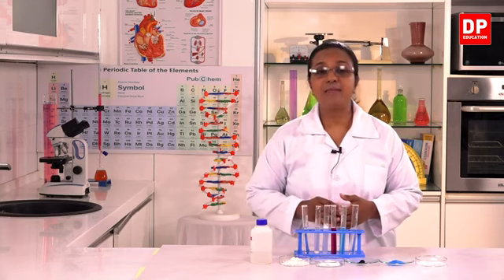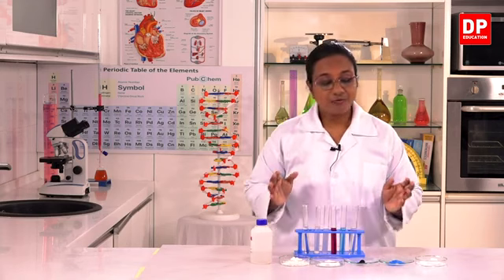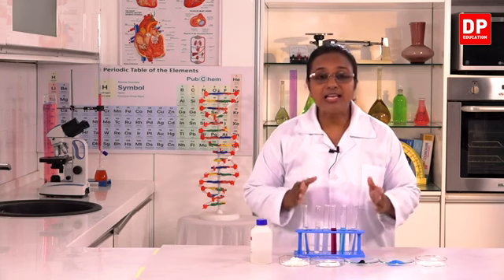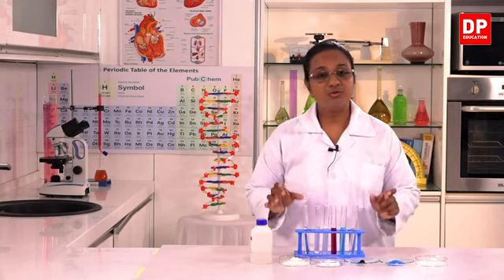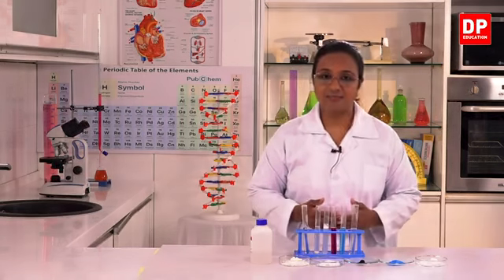So, we call them heterogeneous mixtures. From this activity and these observations, you will be able to identify clearly what homogeneous mixtures are and what heterogeneous mixtures are. So, you will be able to classify these mixtures easily.